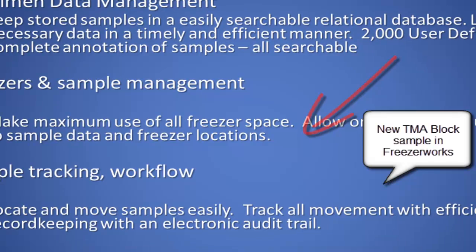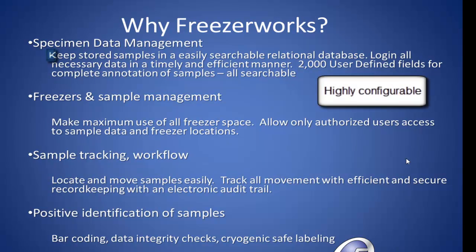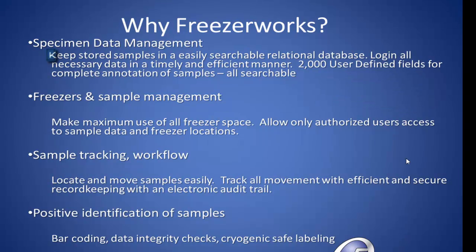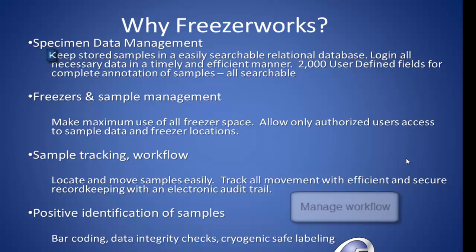Out of many, one. Really quickly, let's just talk a little bit about Freezerworks. If you're not familiar with Freezerworks, we are a sample and specimen data management program. We will keep track of your samples in an easily searchable relational database that is very highly configurable, and you'll have up to 2,000 user-defined fields to create and store all of the data that you need to track in your biobank for your samples. We'll help you make maximum use of your cabinets or freezers, and with security and workflow ability to track your samples using Freezerworks.